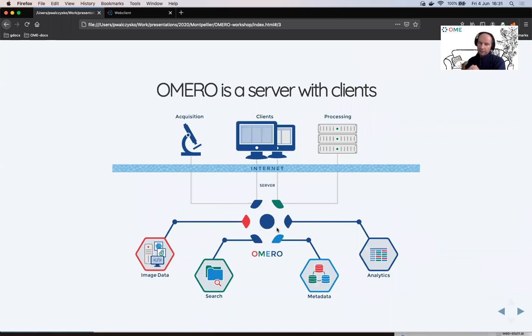OMERO is basically a software where you place your images onto a server and then can remotely access those images from anywhere in the world.